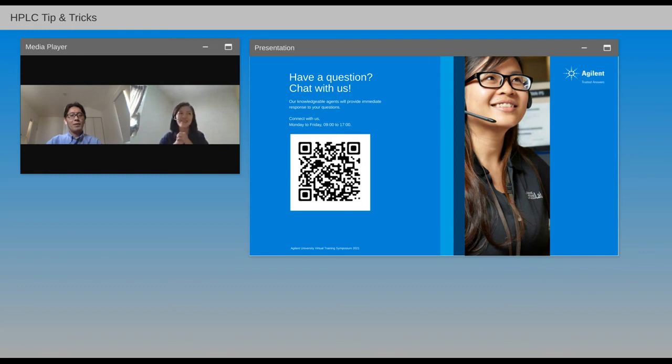Thank you. Okay, it looks like we have one more question. So we still have a little bit of time, so let's do this one as well. Is the ripple value the only indicator of a stable baseline equilibrium?